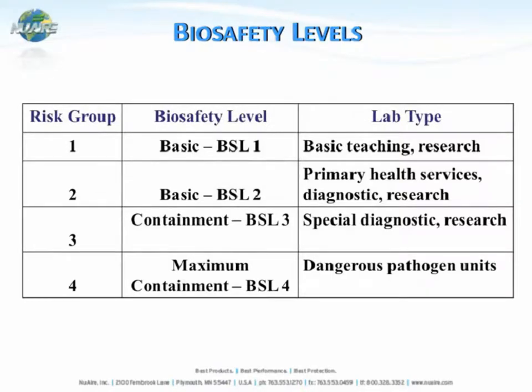When you apply these risk groups to biosafety levels, risk group 1 would typically fall into BSL level 1, which is appropriate for work with defined and characterized strains of microorganisms not known to cause disease in healthy adult humans. Risk group 2 falls into BSL 2, appropriate for a broad spectrum of indigenous moderate-risk agents present in the community and associated with human disease of varying severity. Risk group 3 falls into containment BSL level 3, appropriate for indigenous or exotic agents with potential for respiratory transmission that may cause serious and potentially lethal infection.